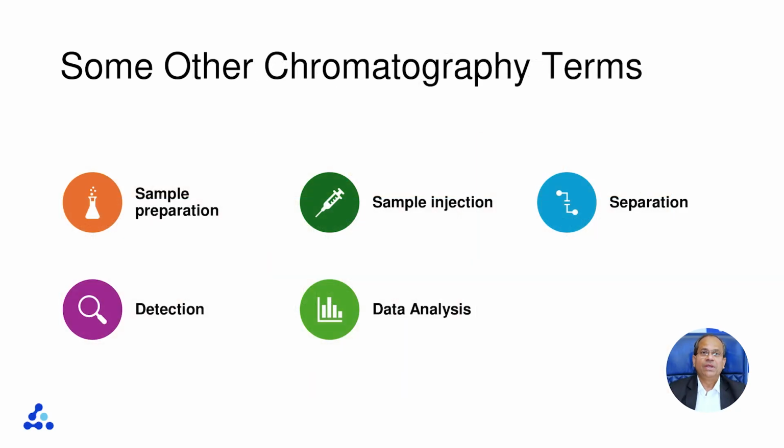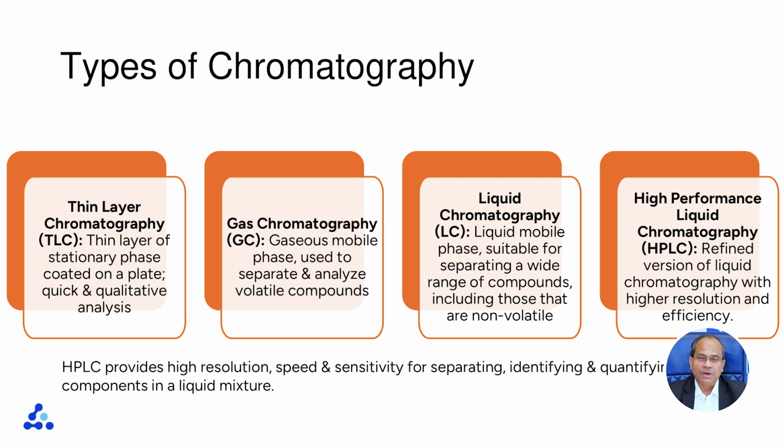Some other terms that we use are sample preparation, sample injection, separation, detection and data analysis. I am not going into the instrumentation part due to the paucity of time. There are various types of chromatography.